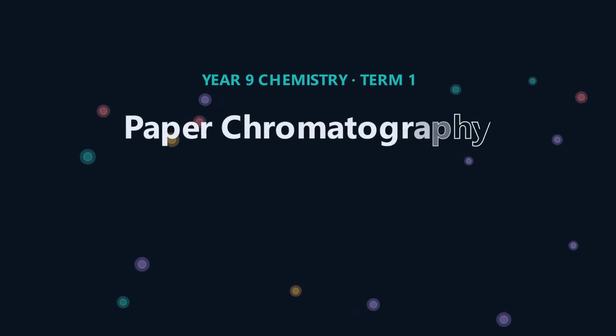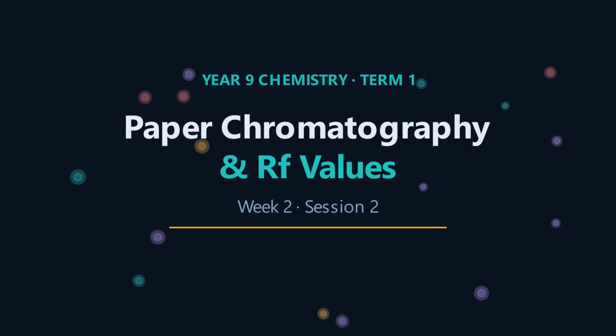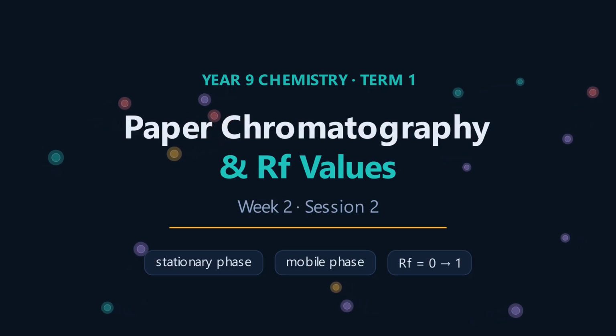This is Week 2, Session 2, Paper Chromatography and RF Values. One small ink spot can hide 3, 4, even 5 different dyes. Today you will watch chromatography pull them apart. Learn the method step by step and turn the result into a number you can compare, the retention factor.